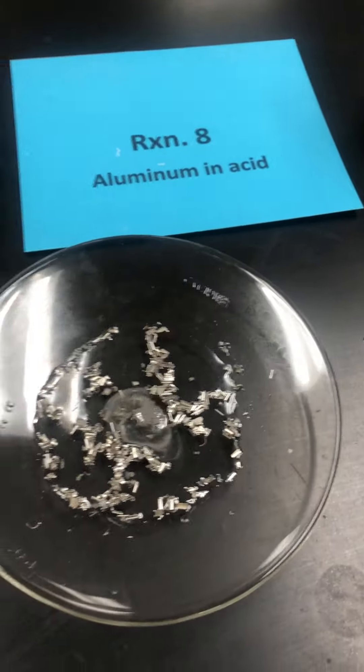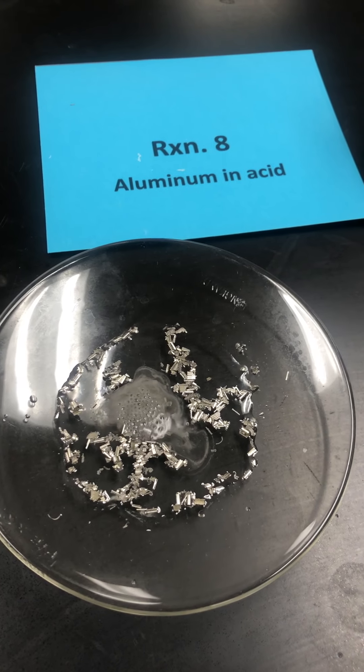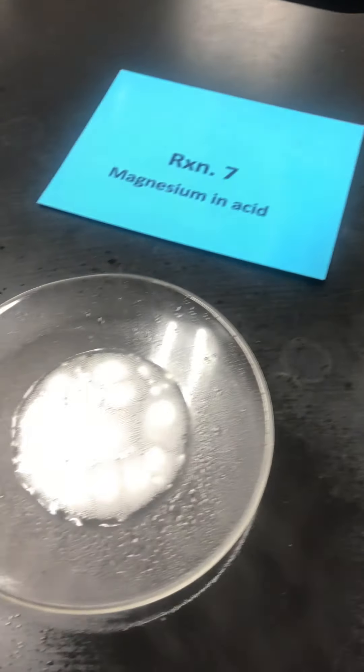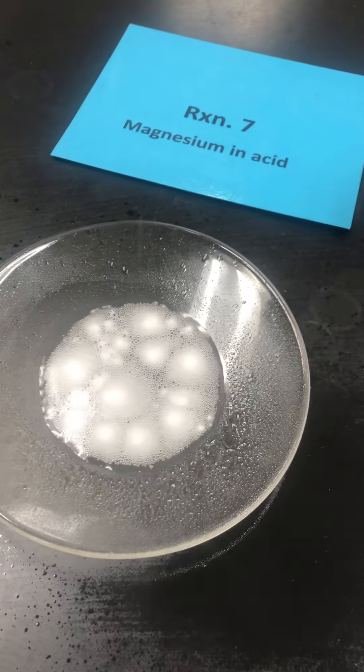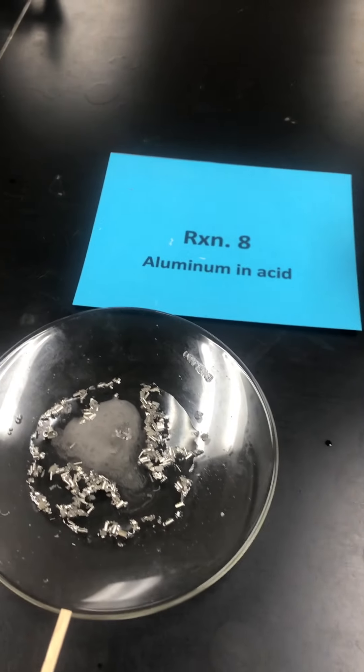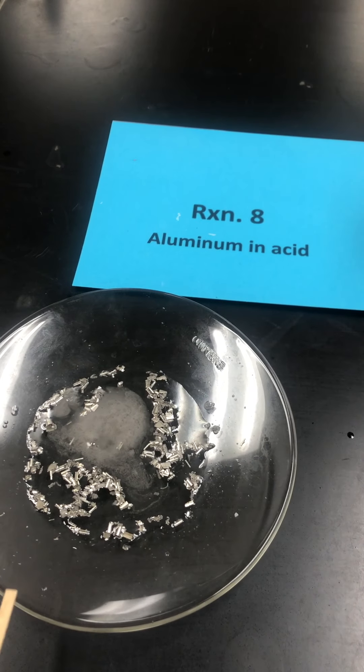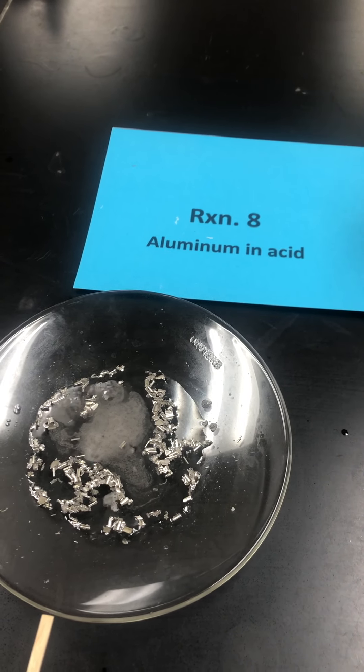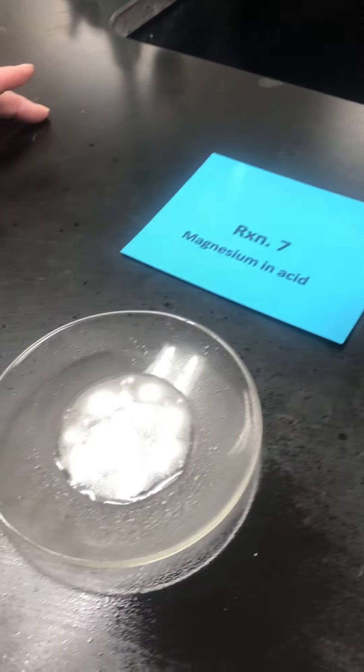Now the first reaction, magnesium, was quite impressive. It bubbled up and caused a mess on the lab table. Notice that the aluminum took a little bit longer. There's a difference in reactivity of magnesium and aluminum, but both eventually are reactive.